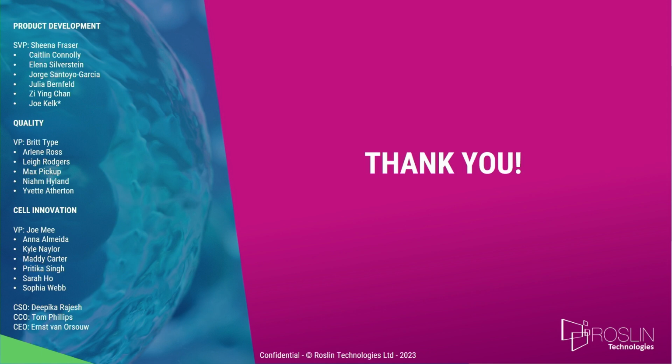Thank you so much for a really interesting talk, Dr. Fraser. Do you think that with the Applikon half liter, did you check the LDH? Was it possible that the viability was higher because some of the cells were sheared instead of being poor viability? It's entirely possible that some of those cells are sheared, breaking them up, and you're going to see that. We didn't see significant foaming, so it wasn't that much shear happening in the reactor. But at the same time, we can't rule it out. And from that point of view, yeah, work in progress.